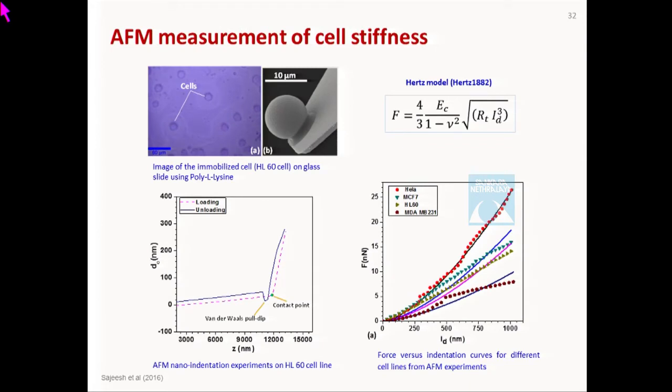We have also used AFM to characterize cells to support what we have observed here. And so this is what I was talking about. You have the probe already in contact with the cell, and when you release it, suddenly, if the spacing is about 10 nanometers, you have a sudden snap because of the van der Waals force. And then when you apply loading, the cell gets deformed.